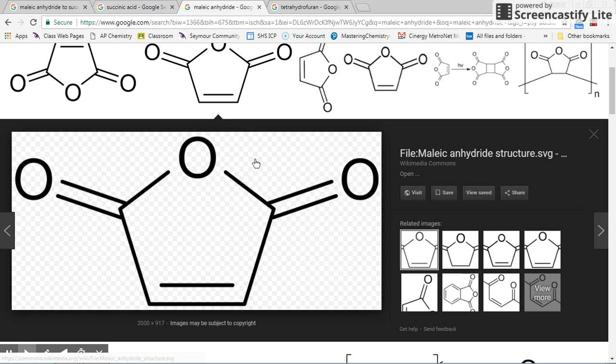So the question is, I know you're going to be able to go out on the internet and look up what happens if you take maleic anhydride and you add hydrochloric acid and zinc, and you'll be able to see what it makes. So you could probably find that out before you got to lab. But our job is to determine tonight what actual carboxylic acid he made.